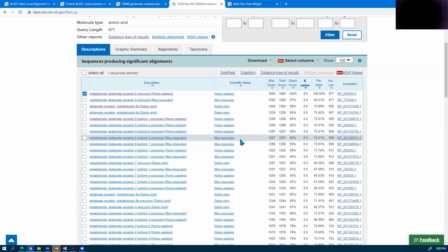And then we have a different organism. There may be many in here for yours, doesn't matter. And then we come back to humans again. So what I want you to do is to select up to 3, as it cycles back to the same organism a third time. So humans, different organism, humans, different organism, and humans again. Okay, so that's how many you're going to select. It's going to be a little bit different, obviously, for each gene. And I have upcoming examples that don't exactly follow this rule. So if yours doesn't quite look like this, keep watching.